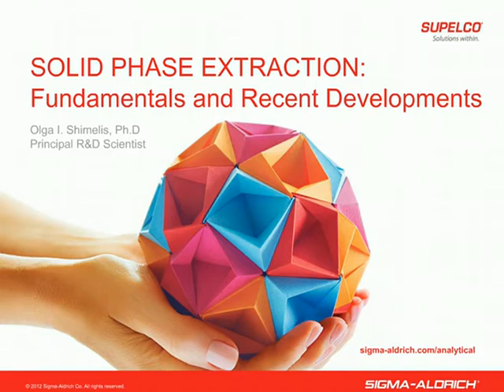And hello, and thank you all for attending this webinar. We are going to talk today about solid phase extraction, about its fundamentals and recent developments in the area. SPE, as it's known, has become the most powerful technique available for rapid and selective sample preparation prior to chromatographic separations. That's because SPE has many advantages. It extends the lifetime of the chromatographic systems and improves qualitative and quantitative analysis.